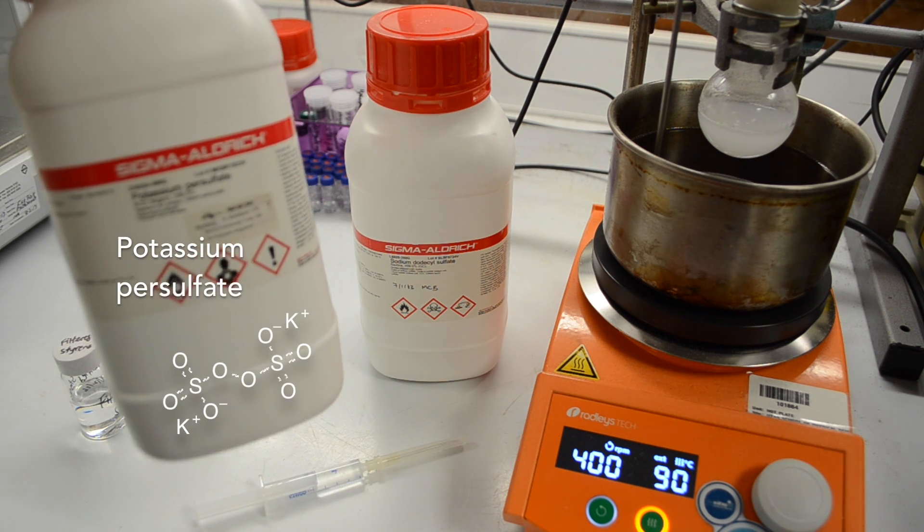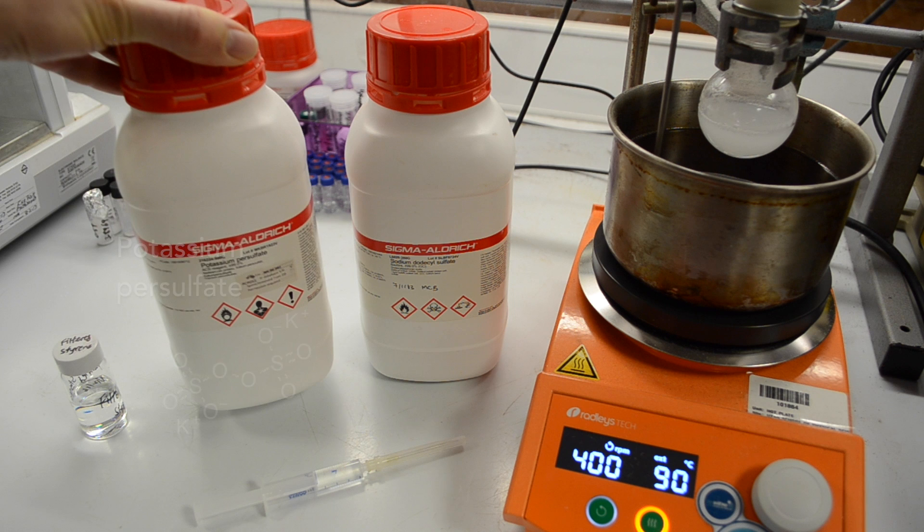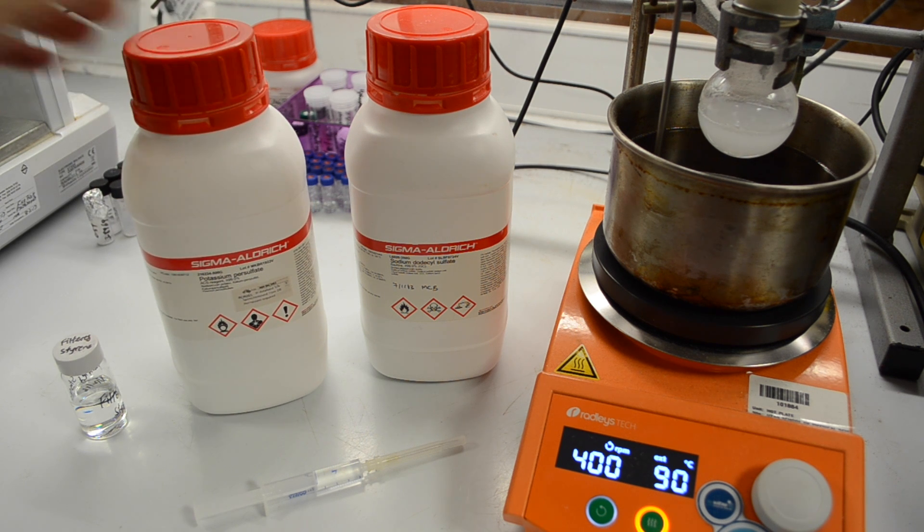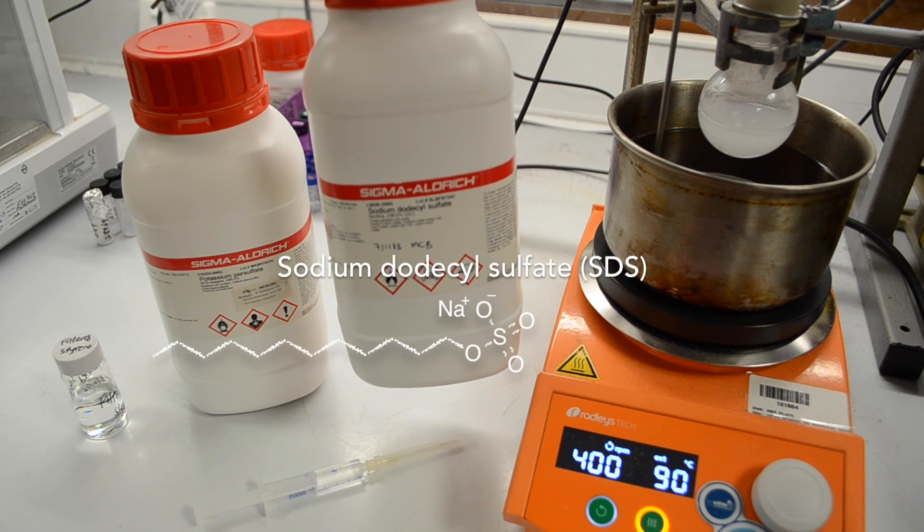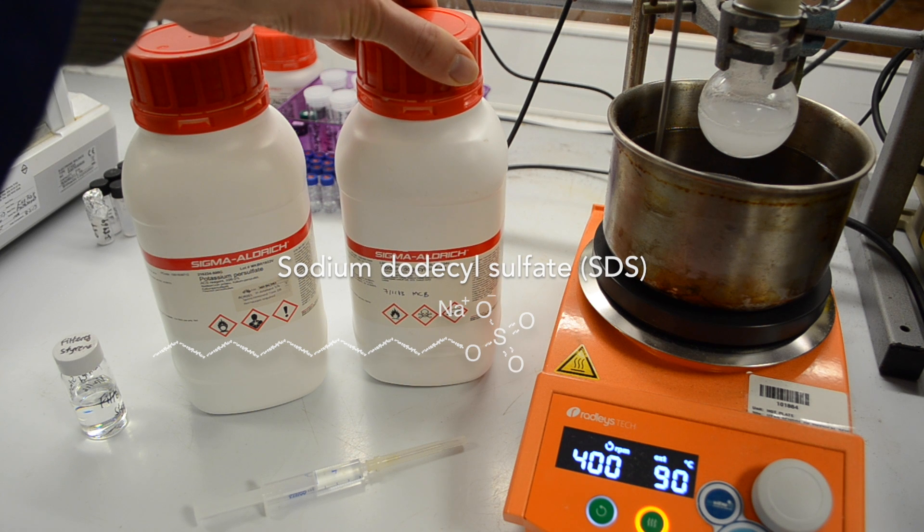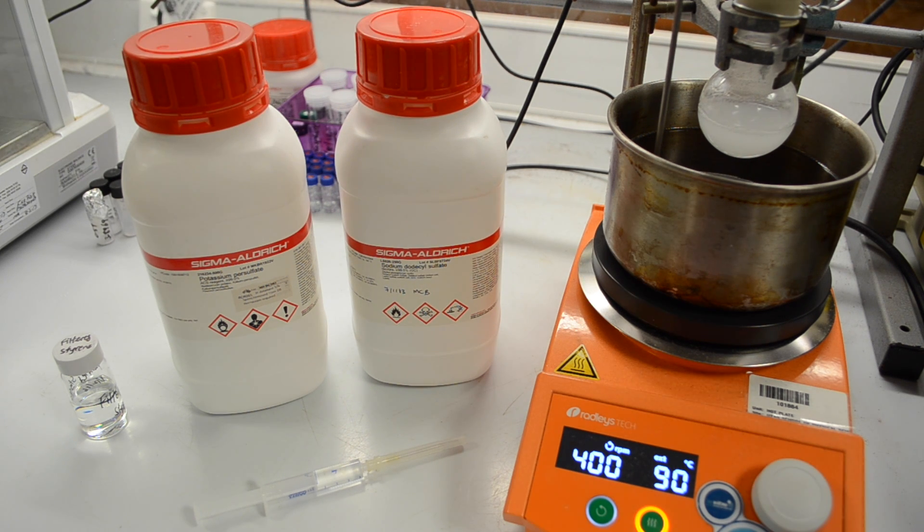We've got an initiator. The initiator is a commercially available material known as potassium persulfate. It's a salt that decomposes into free radicals that can initiate the polymerization. And we also have a surfactant, sodium dodecyl sulfate, which is like a soap. It helps emulsify two immiscible liquids such as styrene and water.